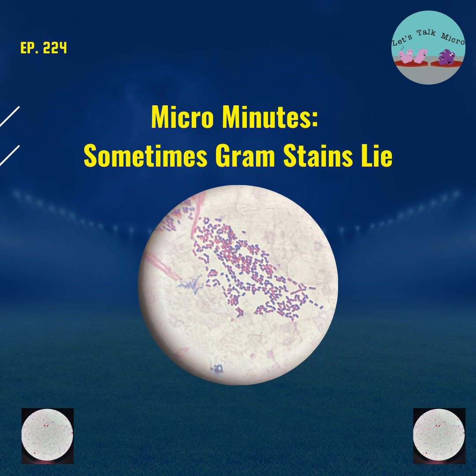So just to recap, the age of the culture: maybe you have a plate that's been sitting there, being incubated 3, 4 days. It might stain abnormal. Or maybe you have an old sample that's been out there for a few days, and that can affect your staining. And then, of course, antibiotic usage.